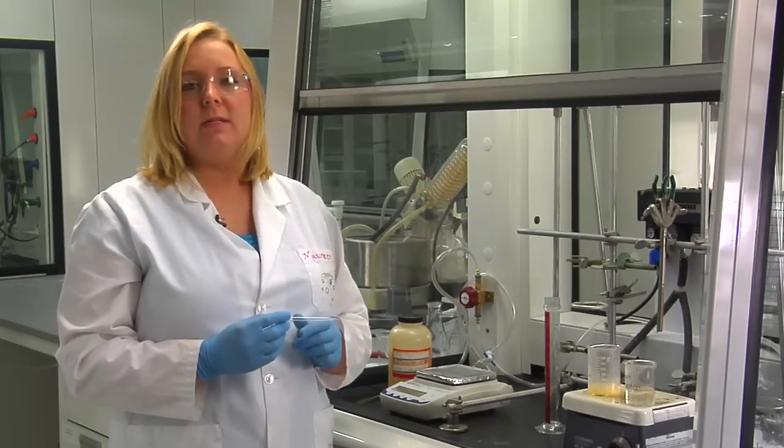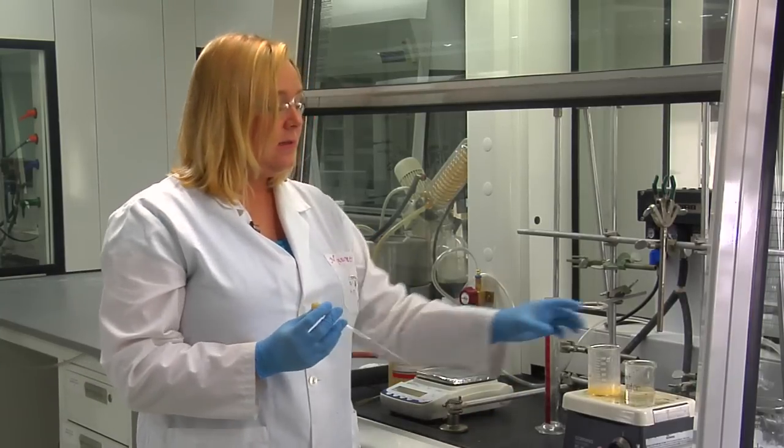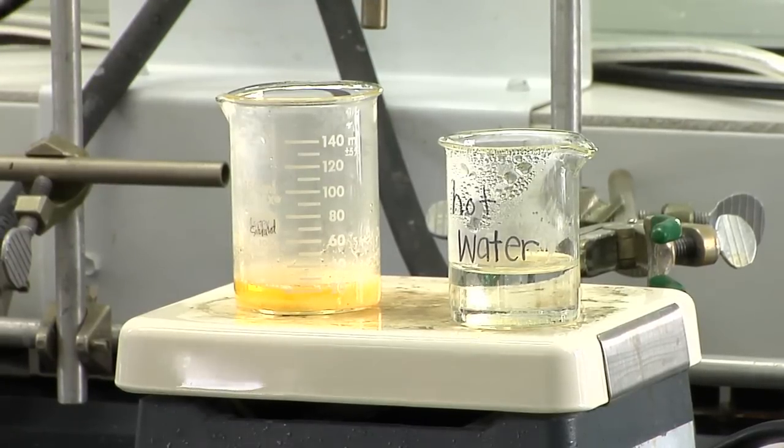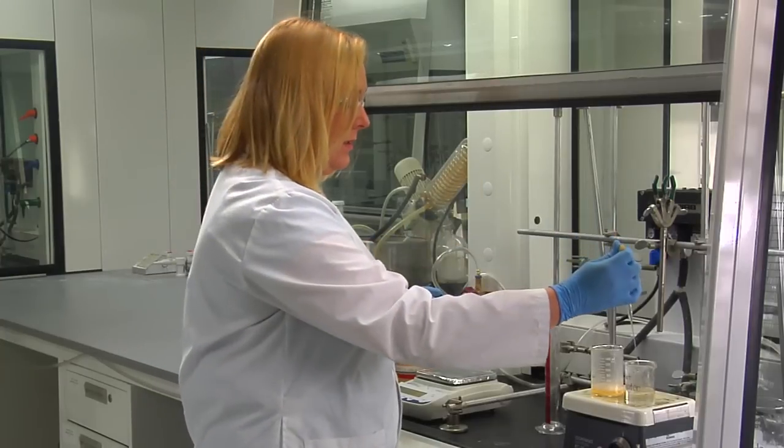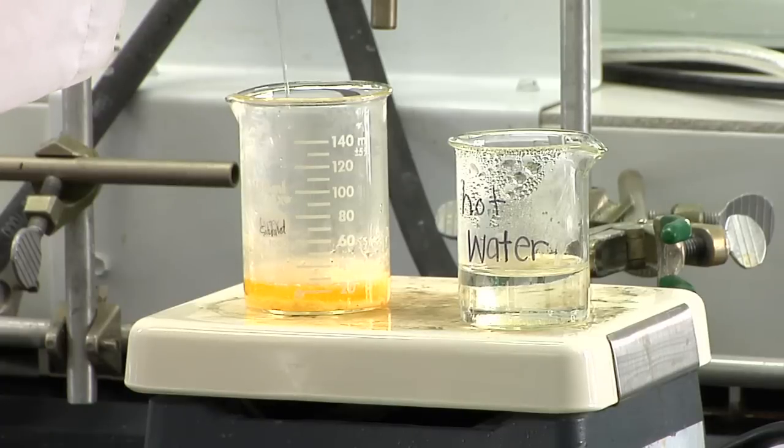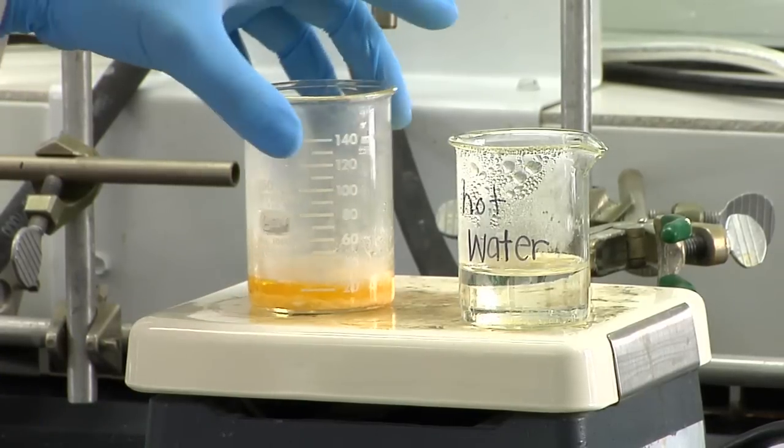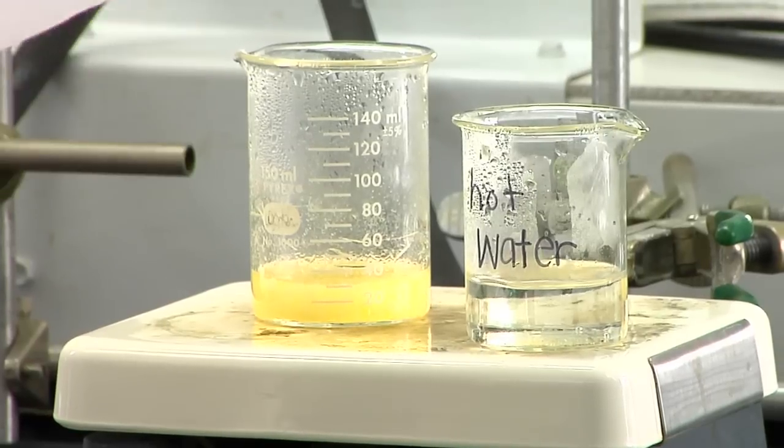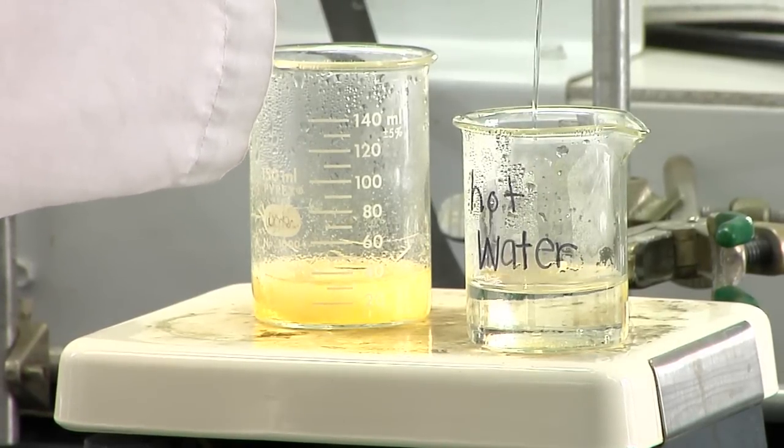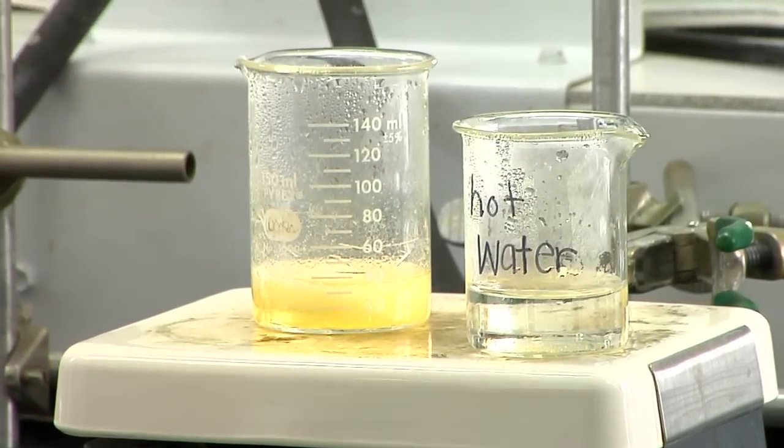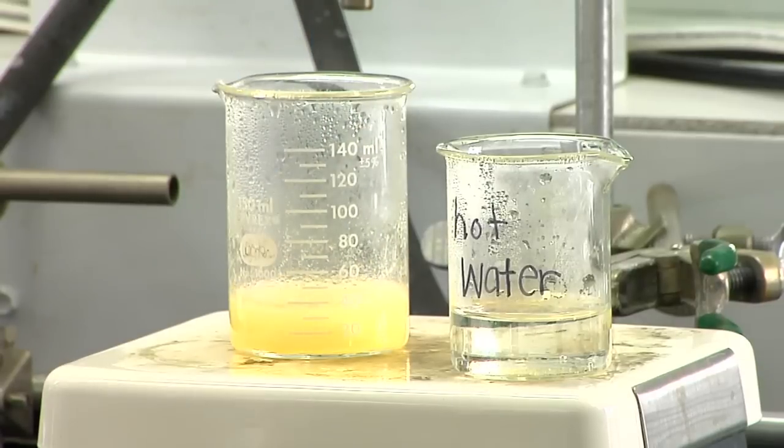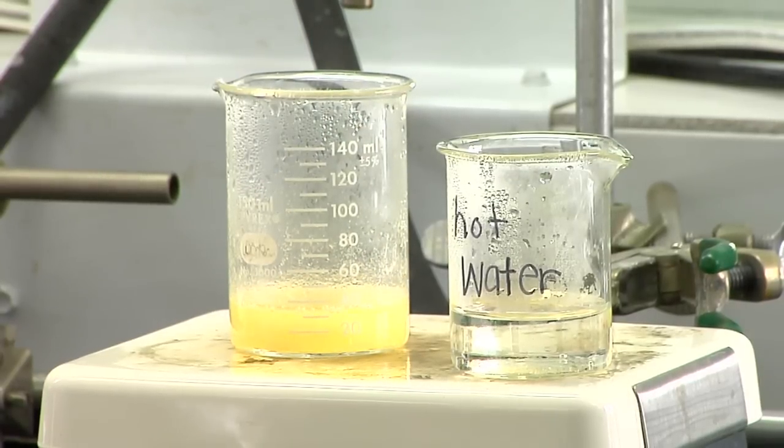Now we're going to add about 2 mils of water using our Pasteur pipette until our compound fully dissolves in the water. Make sure that you record how much water you're adding to your compound to get it to dissolve. With each pipette, we add about 1 mil. Continue to add water until your compound completely dissolves. You just gently swirl the beaker to help your compound dissolve. You don't need to use a stir rod or a spatula.